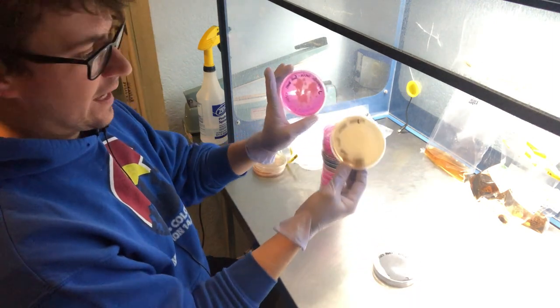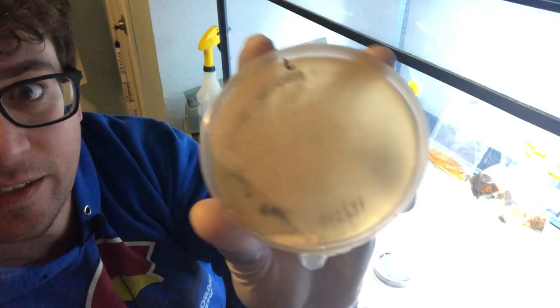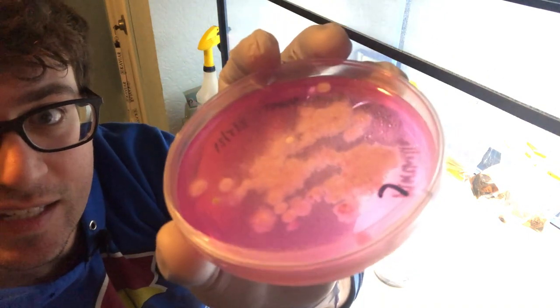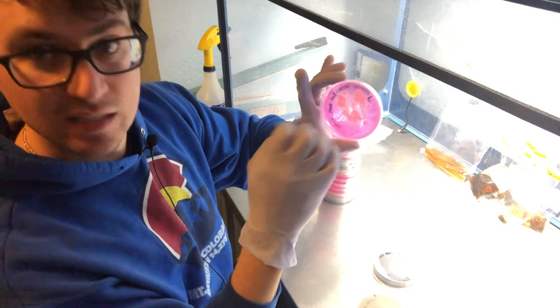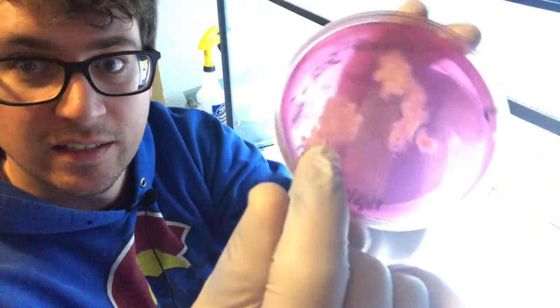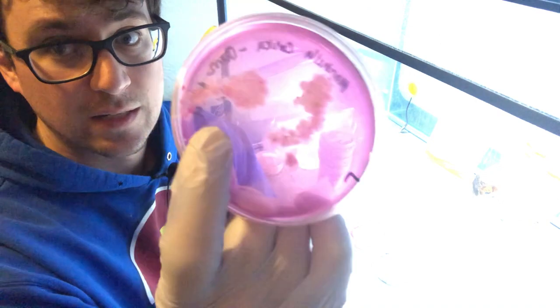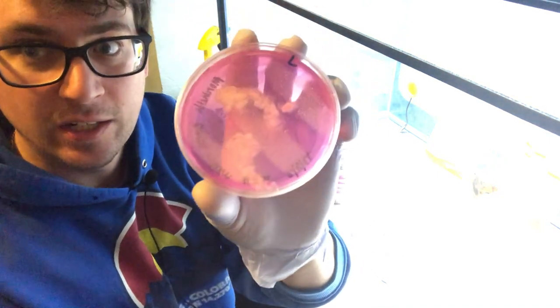Right off the bat, this MEA plate has a lot of mycelium on it, which is why I chose to use these DRBC plates - so you can see the difference in growth rates between the two. The DRBC has additives that slow down the growth and I'm getting some pretty decent separation here. You can see some of those darker colonies on the edge - that right there is a yeast colony. These are also differential media plates because any yeast that appears absorbs that pink color and turns a really dark pink.